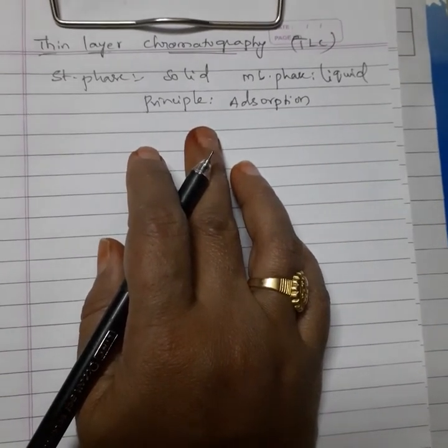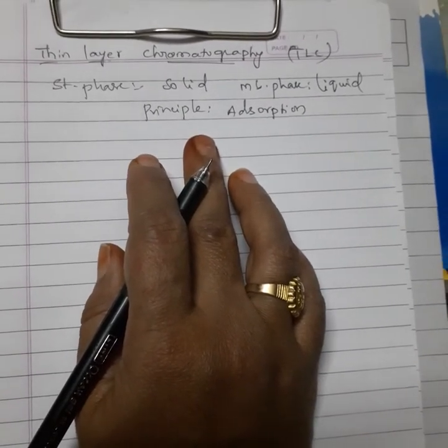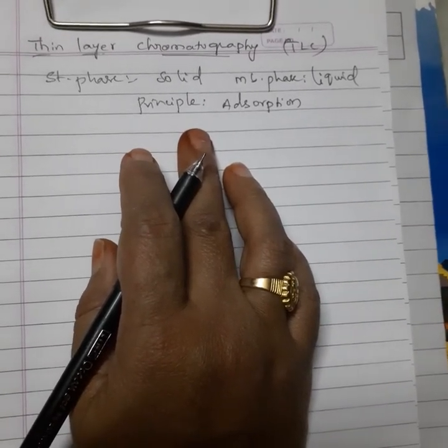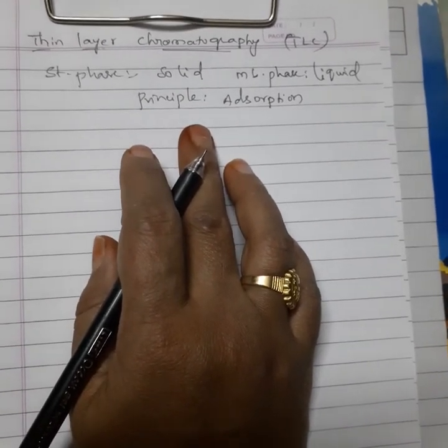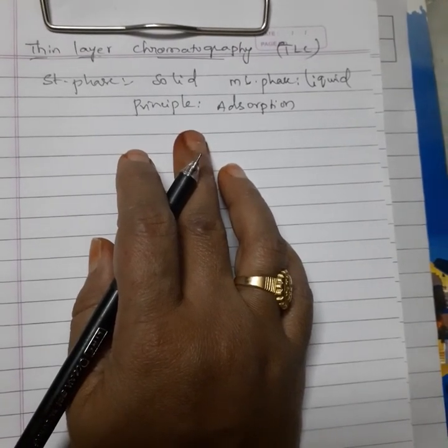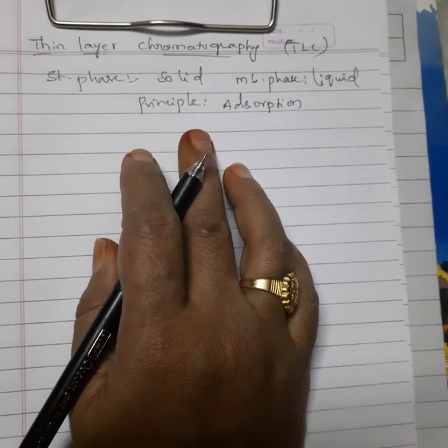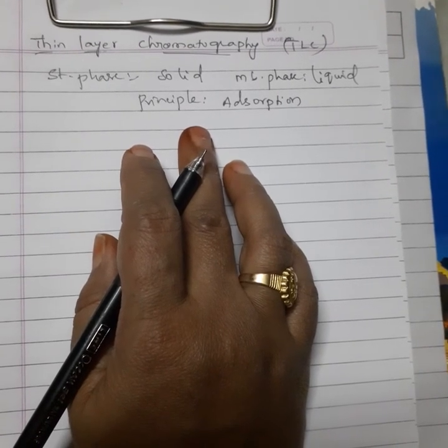Similarly, for the separation of A and B we need only one drop. Using that single drop only, we can tell how many compounds are present in that one. So TLC is highly useful and popular because we need very small quantities of eluent as well as of the compound mixture we are separating.